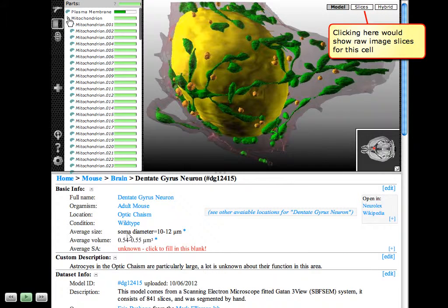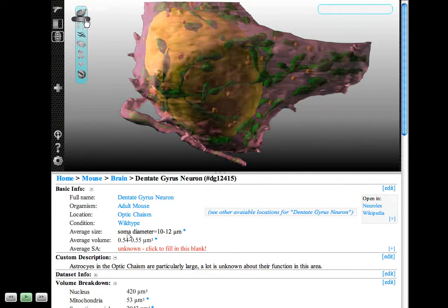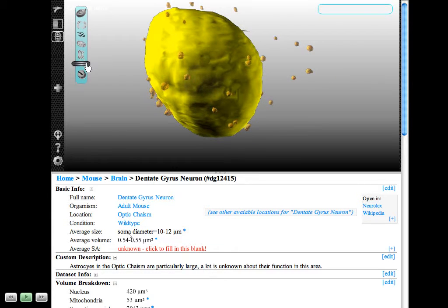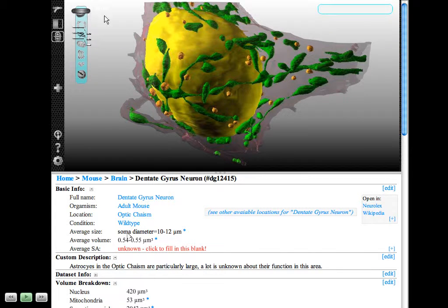Just like before, however, we have the option here to look at the raw data. So let's flip back to the easier slider view though. Different compartments will be automatically matched to different layers so that they can fade in order, and how we peel back the plasma membrane, mitochondria and so on. This interface thus provides a very nice way for the researchers to show off their cell models, but don't forget we also want to make this program more useful, more than just a visualization tool.